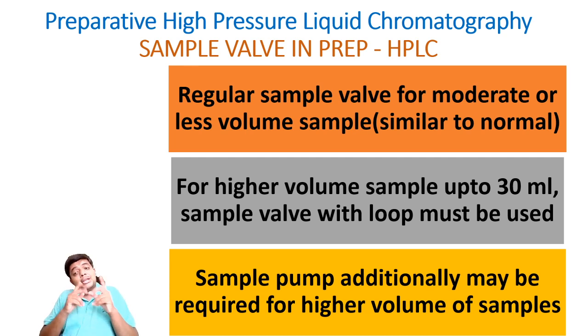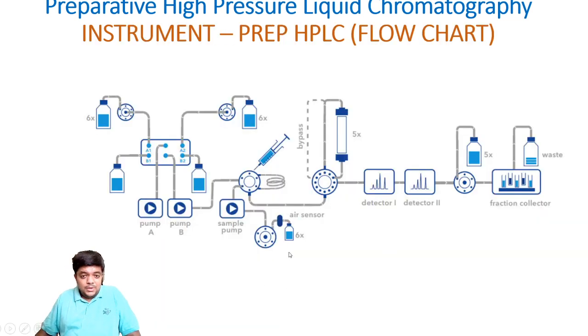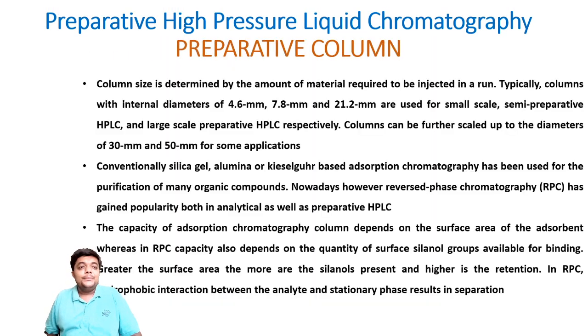Sample pump additionally may be required for higher volume of samples. You can see over here, we have a sample pump that is used when you are using a very high quantity of sample volume to be analyzed, isolated and separated in preparative HPLC. Preparative high pressure liquid chromatography.